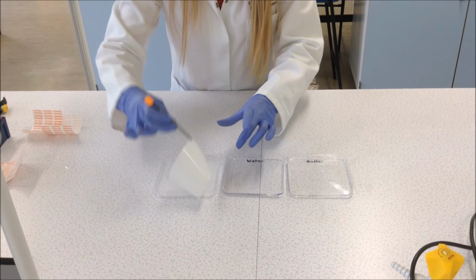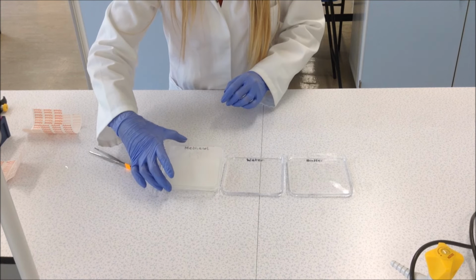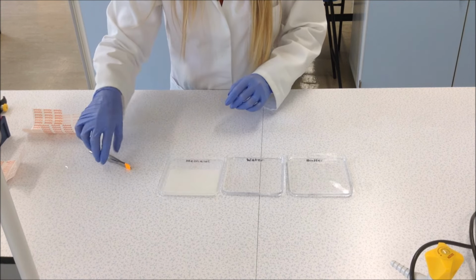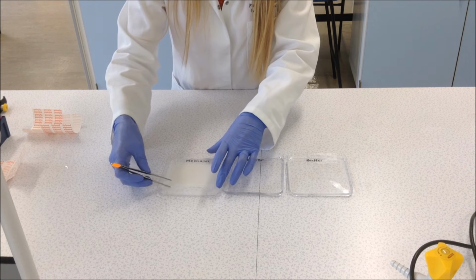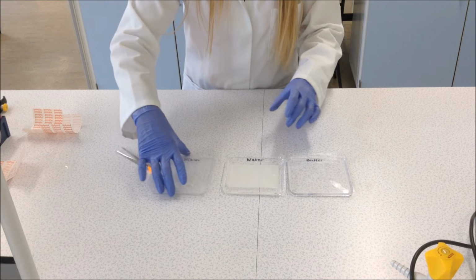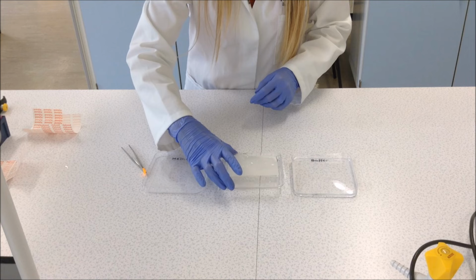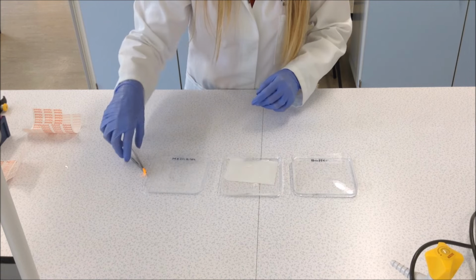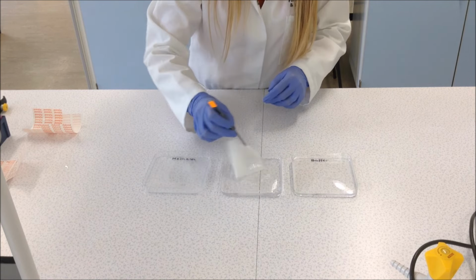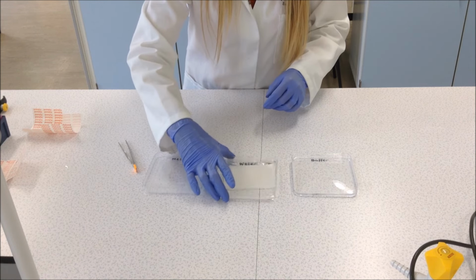You must also make sure you turn the membrane over, allowing both sides of the membrane to soak in the methanol. You then transfer the membrane and allow it to rinse in a small amount of water. What this does is rinse off any excess methanol. Again, similarly to the first step, you must make sure you turn the membrane over, allowing both sides to soak in the water.